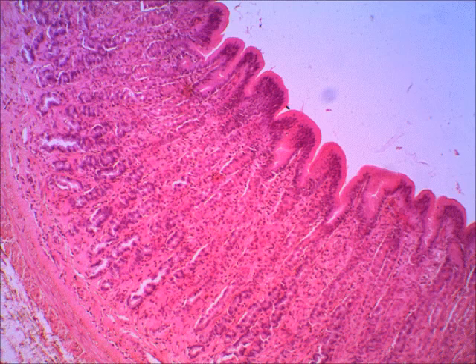Right? If we look at another view, I believe this next one's on a higher power. These first 2 slides were on scanning. And now this is low power. Remember, you start with scanning and then you move to low power. And on this, the gastric pits are real obvious. So you can see those gastric pits. But still, the surface of this is fairly uniform across there. You can see that.